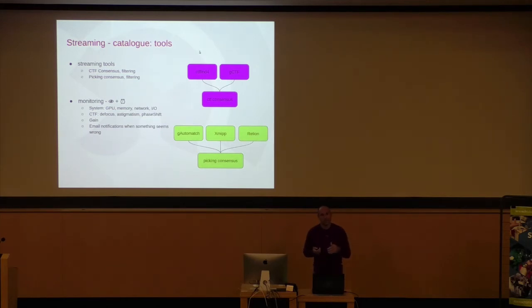So everything goes towards removing user input or actions and having these decisions made at the beginning of your session, and letting the protocol work and filter those items. So basically what you do with CTF, maybe you scan the CTFs and say, okay, I don't like this one, I don't like this one. That process is what the consensus CTF is doing, trying to remove the bad ones.